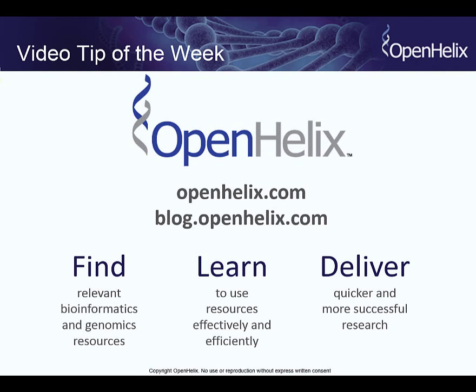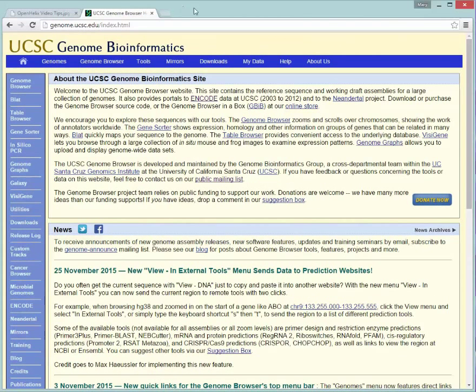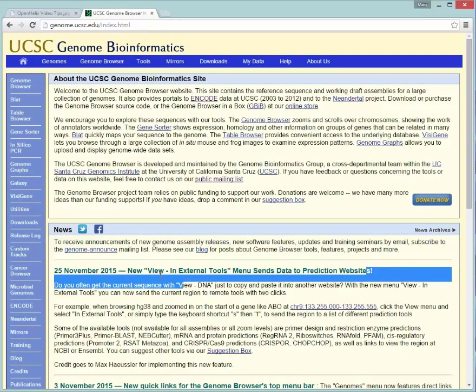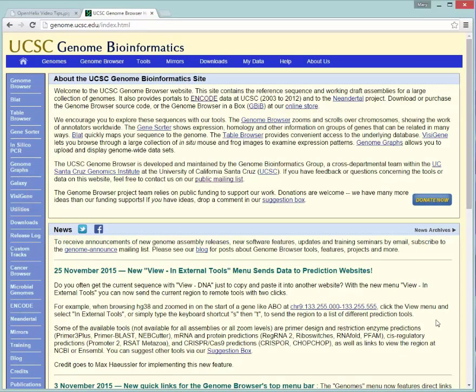Today's tip is going to be a new feature that's been provided by the team at the UCSC Genome Browser. On the Wednesday before Thanksgiving, they released this new feature, and I'm worried that people might not know about it, but it's a really cool option. So I wanted to give you this little tip on how to access this new feature that's available.